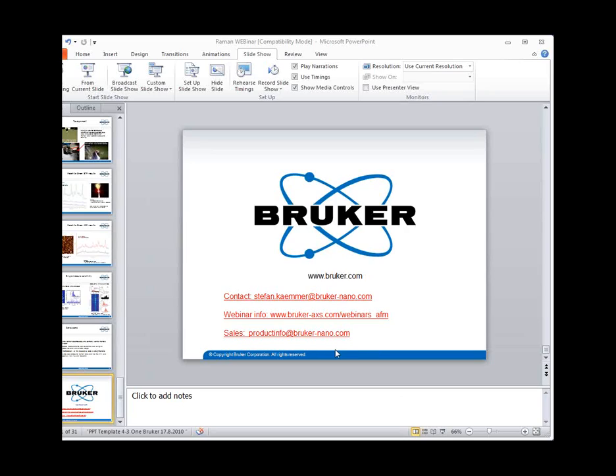Does the CCD require special characteristics for TERS compared with those required for usual Raman? No, not really. You can use the standard stuff. Renishaw builds their own cameras, and most other people use the EM cameras from Andor. We have a liquid nitrogen cooled Princeton in house, which works fine. So that's all good. Whatever works basically. You need a cool CCD, but whatever cool CCD works in a good Raman microscope will work for TERS.